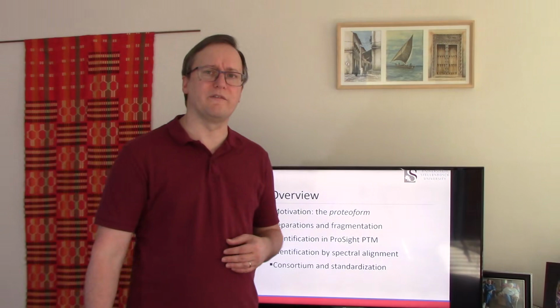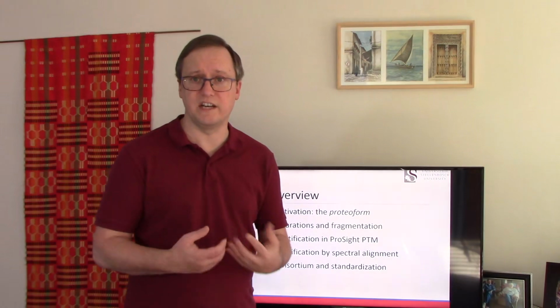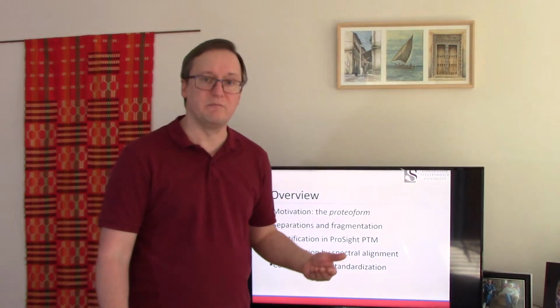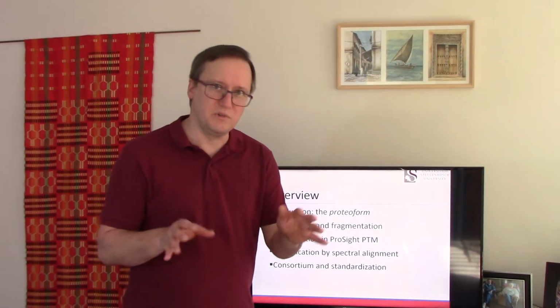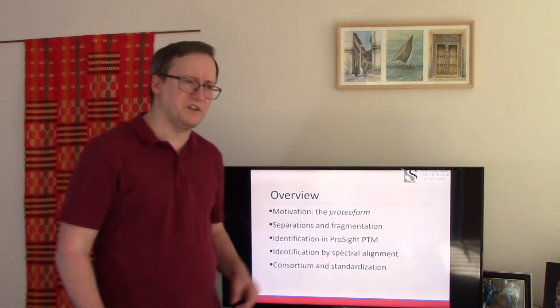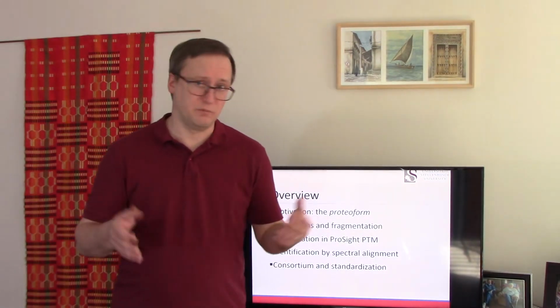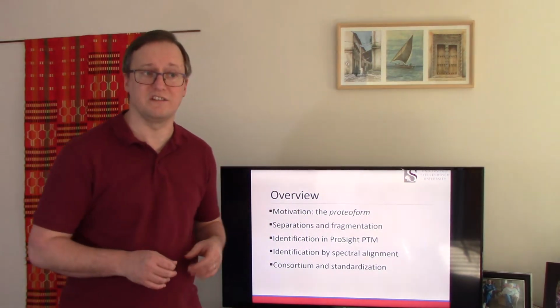From there, we're going to talk about one of the largest identification suites out there for handling top-down data sets, and that is ProSight, or ProSight PTM, or ProSight Lite, their relatively new version. So discussing how that algorithm does its thing and explaining its relationship to bottom-up proteomics identification algorithms is, I think, very worthwhile. From there, we'll talk about a rather different kind of algorithm, one based on dynamic programming that uses an approach called spectral alignment. It's really become a very valuable technique for analyzing very complex post-translational modification sets in particular.